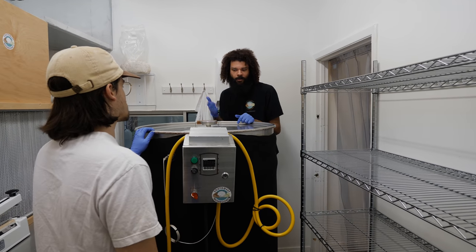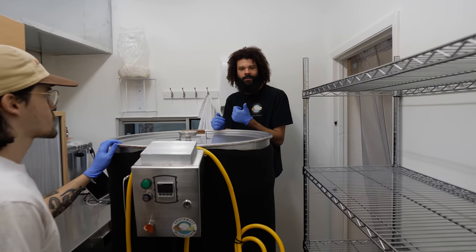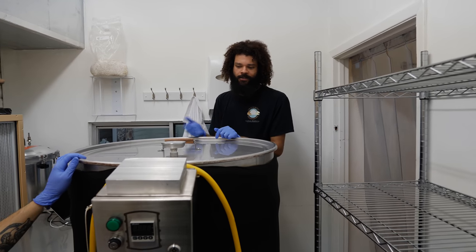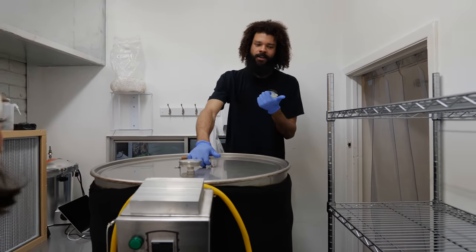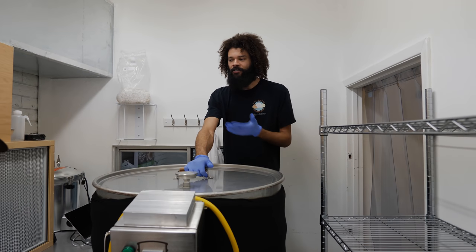So we're in the lab. We're about to unload a bunch of sterilized substrate. It's finished the sterilization process, so now it's time to get it in the lab and get it ready for the next step, which is going to be inoculation.